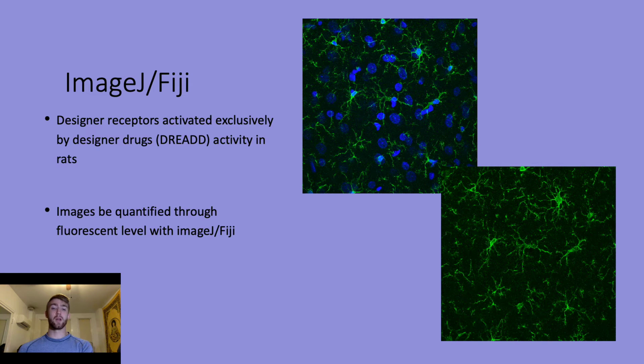The blue is for a nucleus marker of the neuronal cells, whereas the green stands for zinc finger transcription factor. It's a ZIF stain, and that's to indicate learning and cellular expression in the neurons. And the final stain, which you cannot see here, is the stain for the dopamine 1 receptor, and that's a red stain. But here it's difficult to visualize.